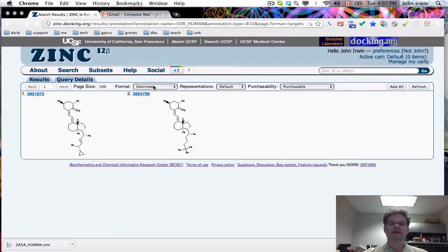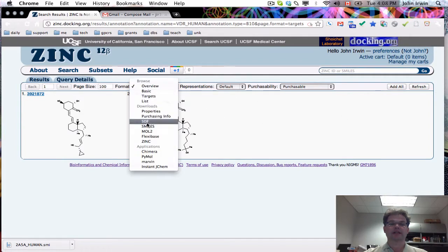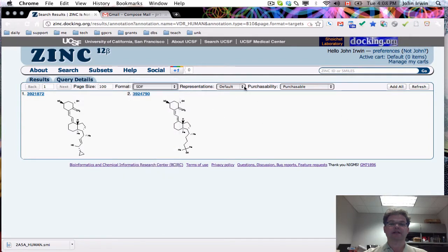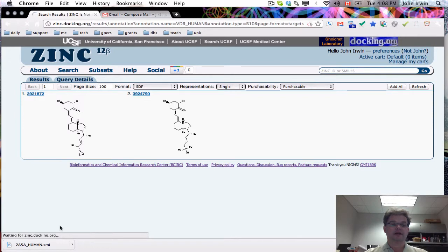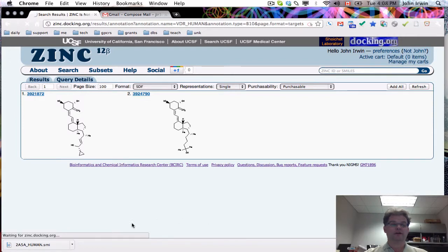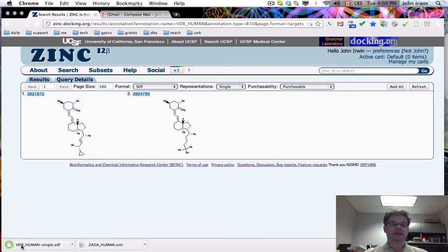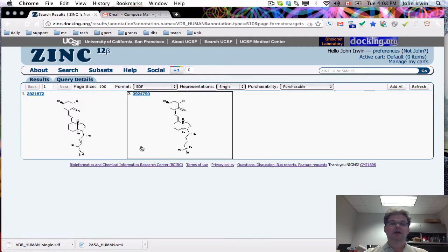There are two molecules exactly. If you want to download them in SDF format and you want to download them in a single representation at pH 7, you simply click on that. Then it'll download the file over here. We wait a couple of seconds and those are the single representations at pH 7 for those two molecules.